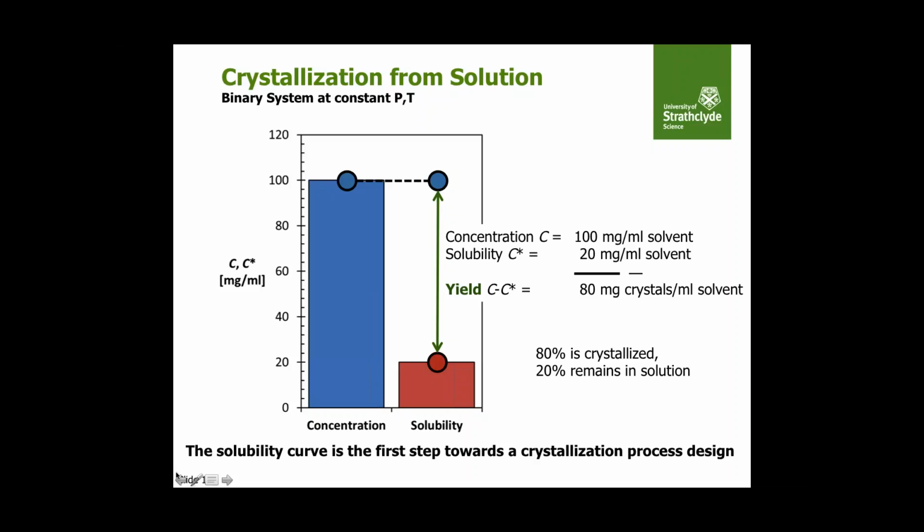So the solubility curve is actually the first step towards a crystallization process design, because it tells you the amount you can crystallize and the amount you cannot crystallize. So it's important to know the solubility.